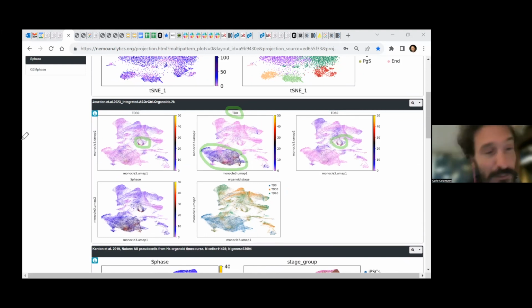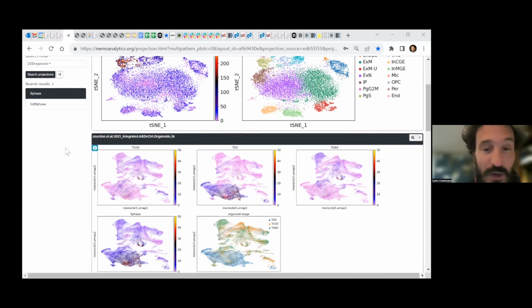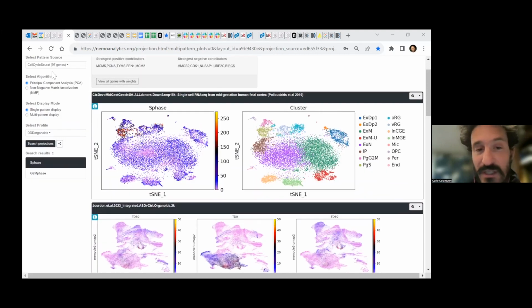But anyway, the point here is that once you get lots of data sets together and you bring in genes or gene lists, and these can be as complicated as a genome-wide principal components with weights for every gene, there are different ways we can project these gene lists. Up here in the corner, I'll show you. This is just a list of genes with no weights on it. But you can get quite creative with the in silico experiment you can design when you pick a bunch of data sets to look at, and then you pick a bunch of interesting dimensions to look at in them.